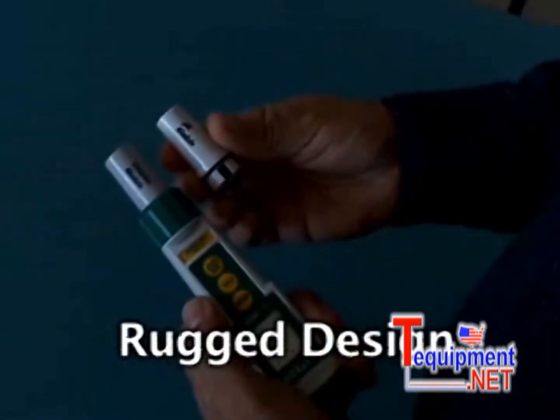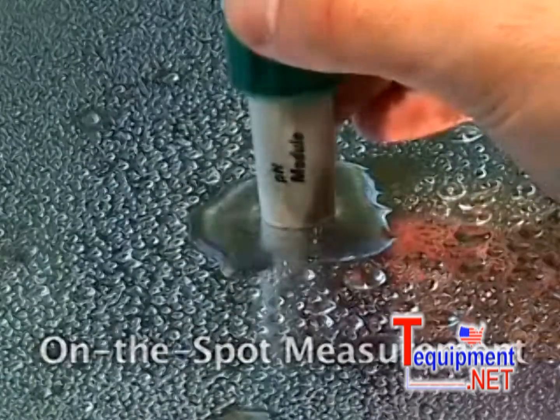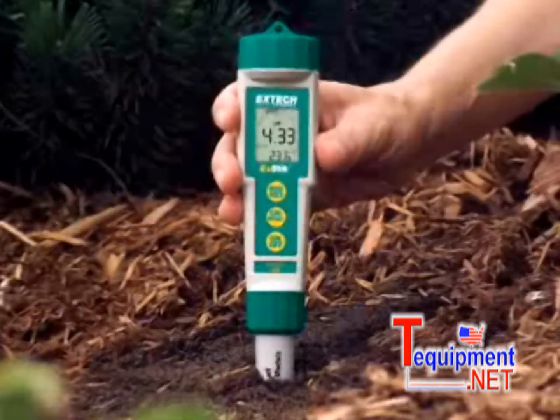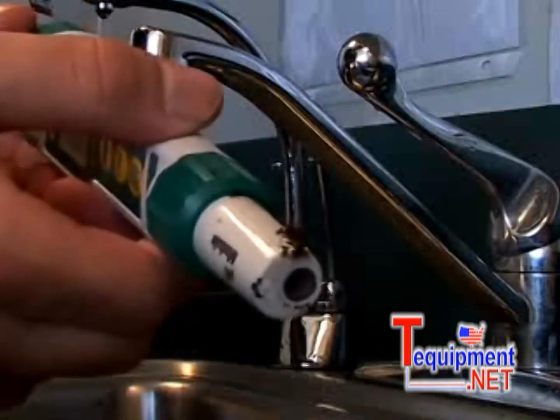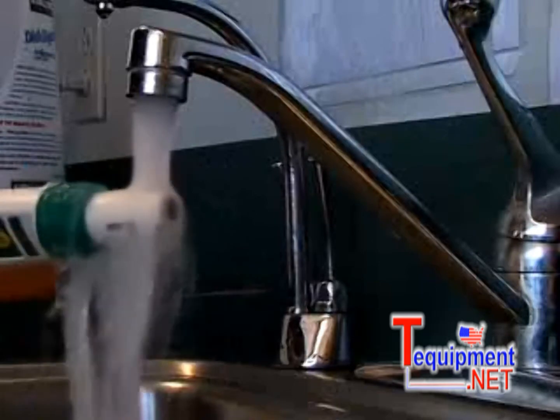Its rugged design can withstand harsh environments and can also measure on solids and semi-solids. What sets this meter apart is the unlimited flexibility and easy maintenance. To clean, simply rinse the tip with tap water and dry off with a soft cloth or paper towel.